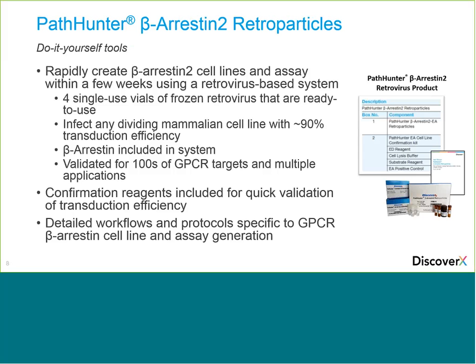So after cell plating, and your creation of your PK GPCR plasmid, you picked out the right vector, et cetera, you transfect your cells with this plasmid, using standard transfection methods. Then you perform the antibiotic selection step, change the media, add neomycin in this case. After 5 days of selection with that, you add both the neomycin and the hygromycin. Then incubate for an additional 9 to 12 days under the selection of both of them.